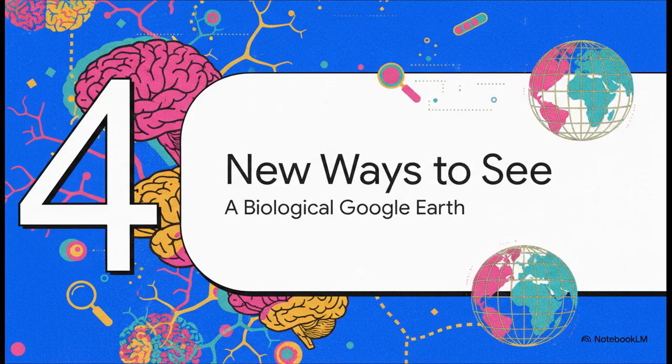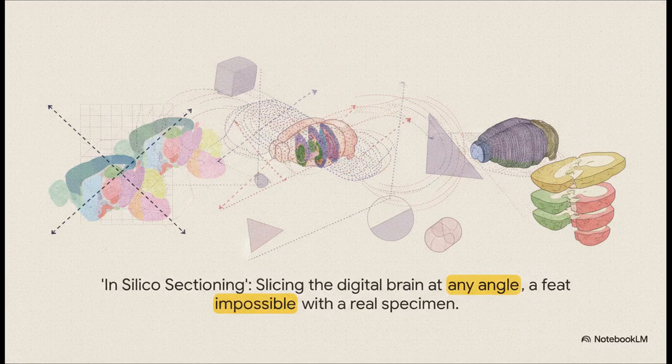And this is where it gets really, really fun. What can you do with a perfect digital copy of a brain? It's basically like having a biological Google Earth, and it gives scientists some brand new superpowers that were pure sci-fi just a few years ago. Superpower number 1, in silico sectioning. See, when you physically slice a real organ, that's it. You're stuck with that one angle. But with a complete digital model, you can reslice it any way you want. Sideways, top down, a weird 45-degree angle, you can explore biological structures from perspectives that were literally impossible to see before.